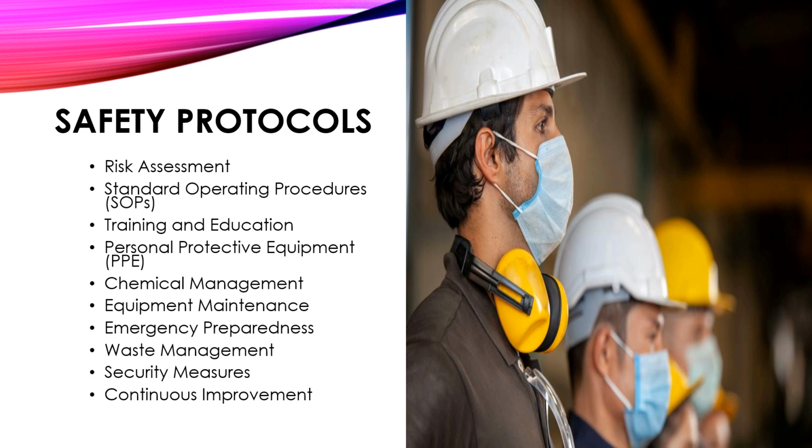Conducting thorough risk assessment for all laboratory procedures and activities to identify potential hazards and evaluate risks and implement appropriate control measures is very important. Second is standard operating procedures, SOPs. Developing and enforcing SOPs for all laboratory operations, including handling of hazardous materials, equipment usage, emergency procedures, and waste management is key, as this helps to prevent mistakes that could lead to disastrous consequences.